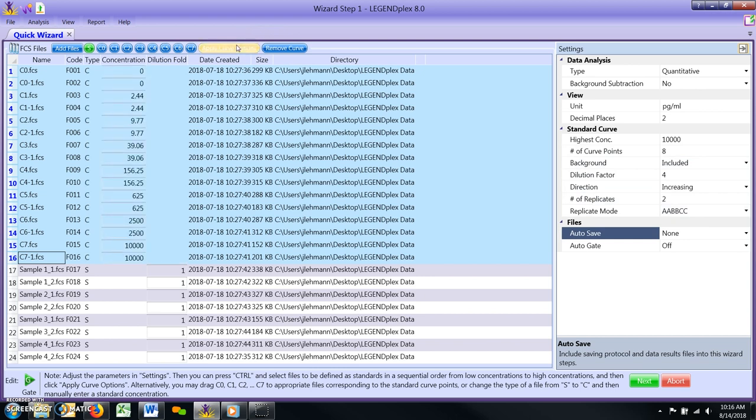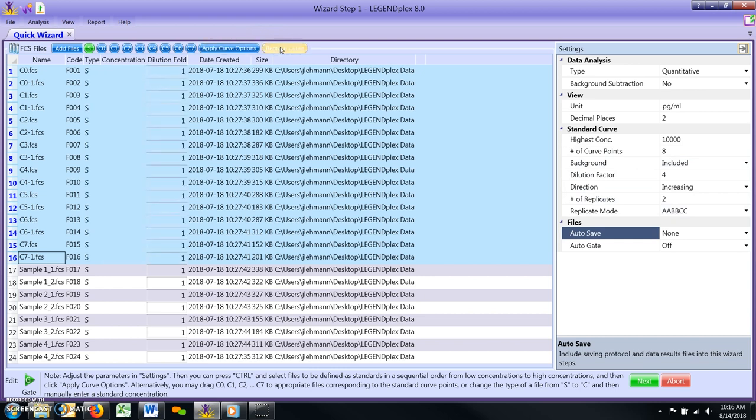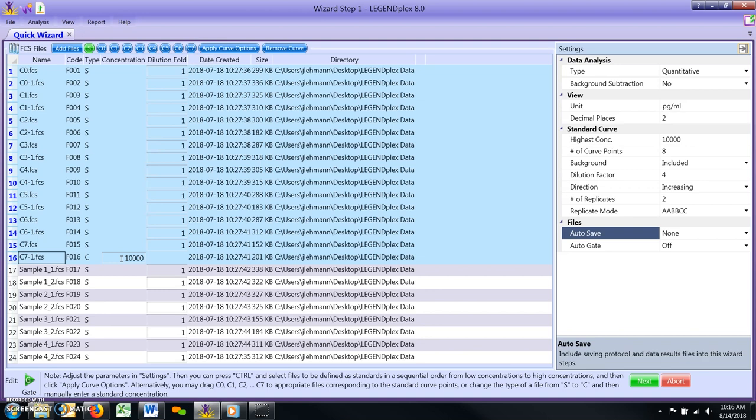Alternatively, you may also left-click and drag the circular blue standard curve point icons to the respective FCS files to assign a designation.